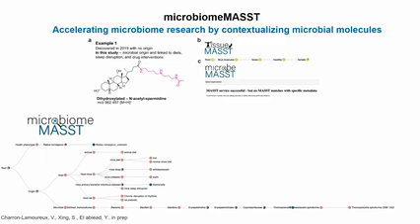Here it's a control environment where we have different time points, so we know by confirmation in the experiment that we did that this microbe is able to produce this specific one. And we can start to contextualize this specific finding, where you can have different hosts. It's found in mice with different interventions: we have diet intervention, sleep deprivation study, bacterial infection. It's also found in rats. So now you can start to contextualize and formulate way more hypotheses by using this new tool compared to the previous one.